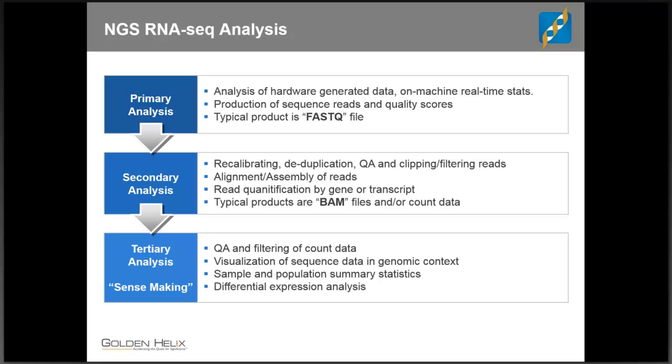And finally, the tertiary analysis involves quality assurance and filtering of count data, visualization of sequence data in genomic context, sample and population summary statistics, and differential expression analysis.